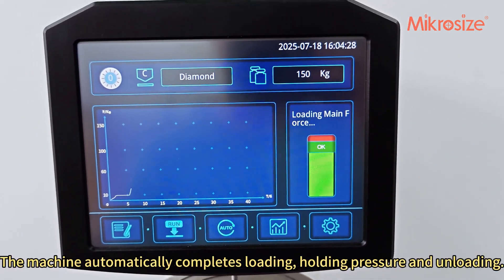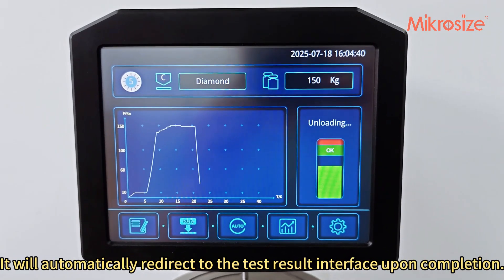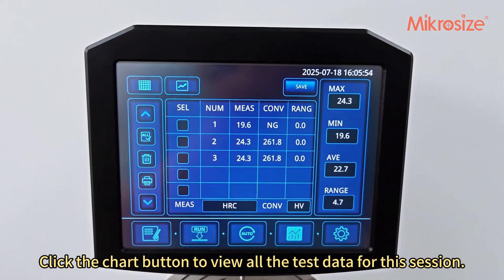The machine automatically completes loading, holding pressure, and unloading. It will automatically redirect to the test result interface upon completion. Click the chart button to view all the test data for this session.